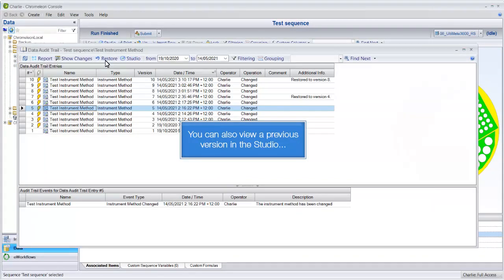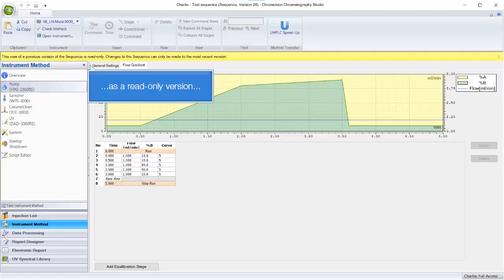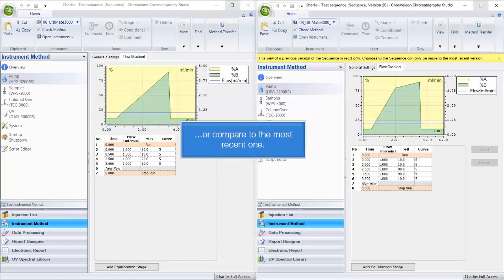You can also view a previous version in the studio as a read-only version, or compare to the most recent one.